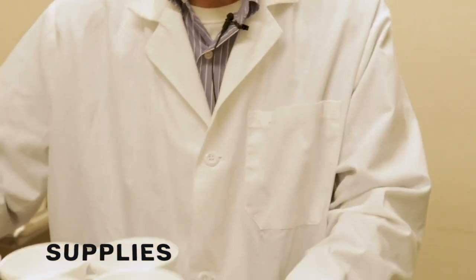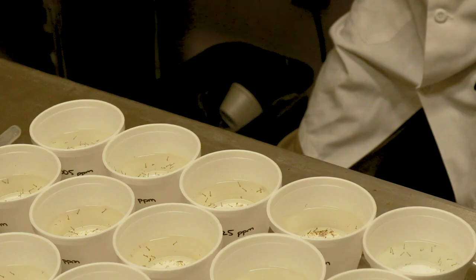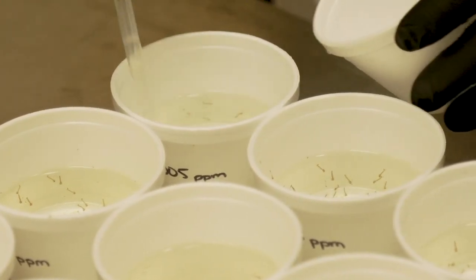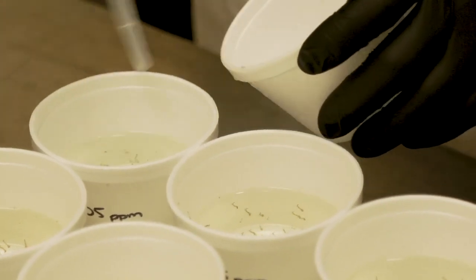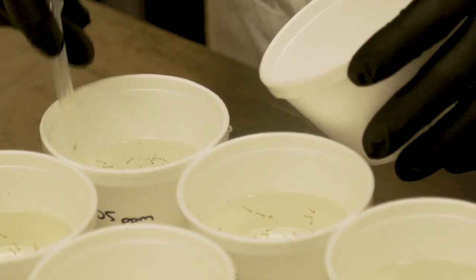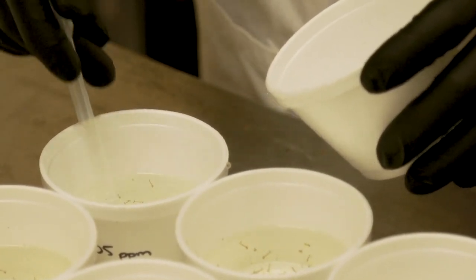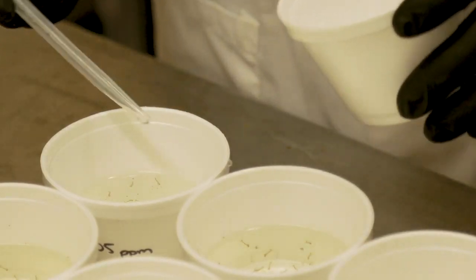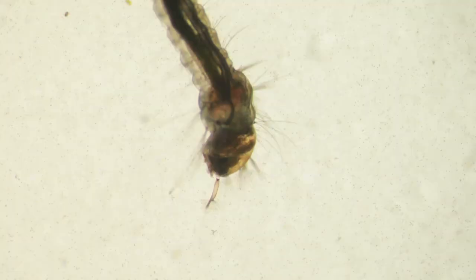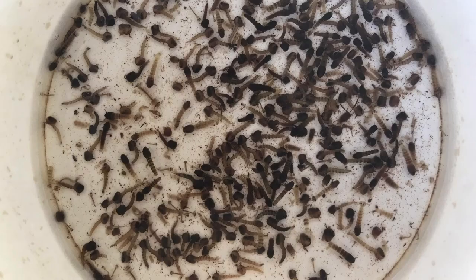To test the levels of resistance of mosquito larvae, you need the following items: mosquito larvae in the appropriate instar for testing. Most bioassays that assess the susceptibility of mosquitoes to comparatively rapid mortality, let's say within 1 or 2 days, to a control agent use early 4th instar larvae in 1-day trials, and typically 3rd instars in 2-day trials. For control agents that require ingestion by the larvae, you do not want to use late 4th instars that have ceased feeding prior to pupation.